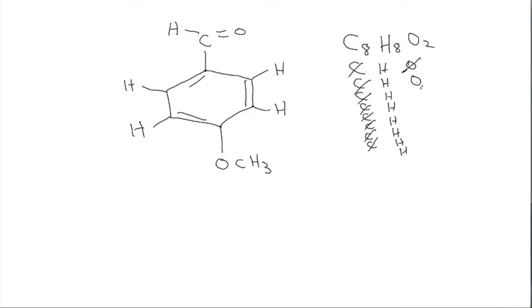And one thing that makes sense here now is these hydrogens are absorbing around 4. That wouldn't make sense without this oxygen. Without the oxygen, they shouldn't absorb there. If there was no oxygen here, where does your table say these hydrogens should absorb, if it's just directly connected to the benzene ring? Maybe 1.5 to 2.5? That's right. That's what the table I sent you would suggest.